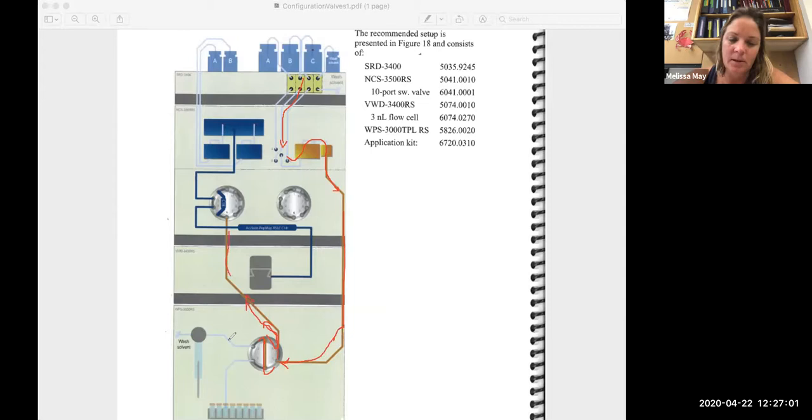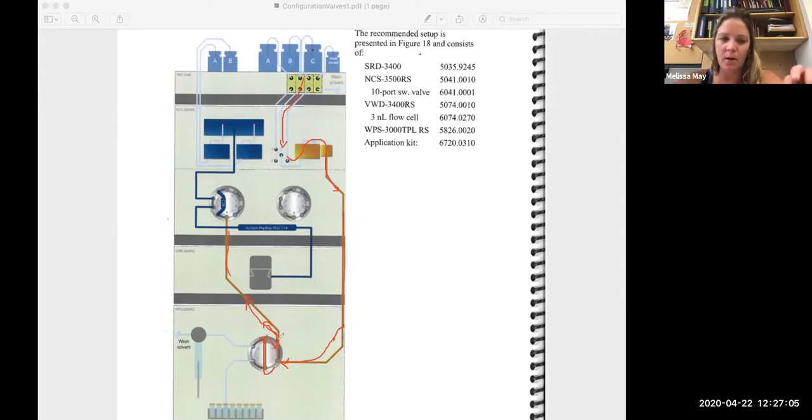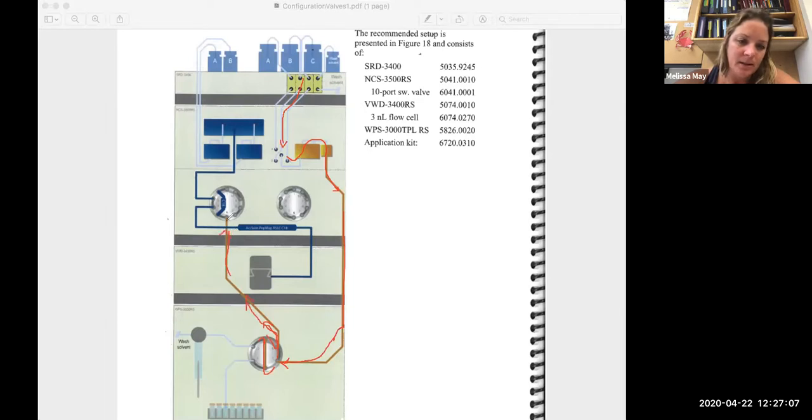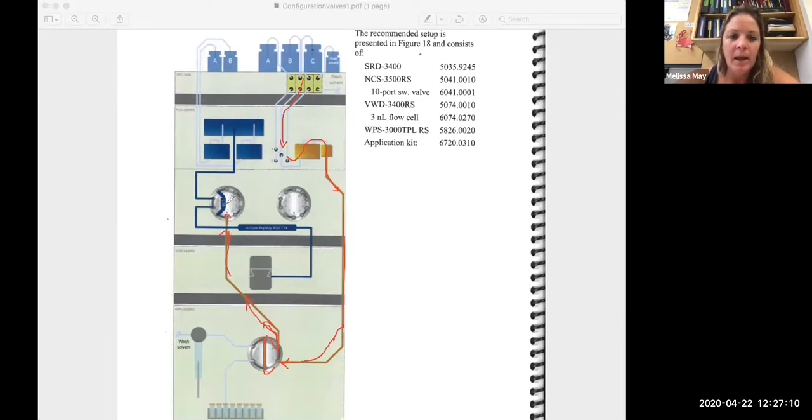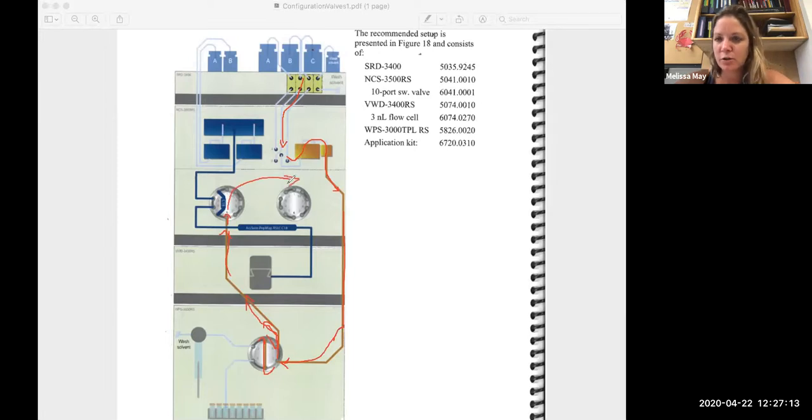But basically, this is going to come up into our 10-port valve and just go straight to waste.